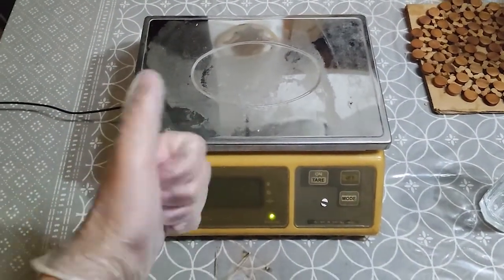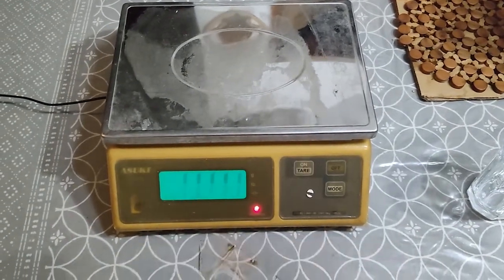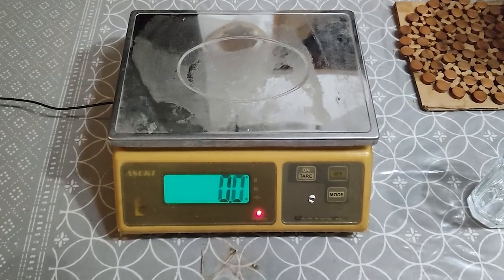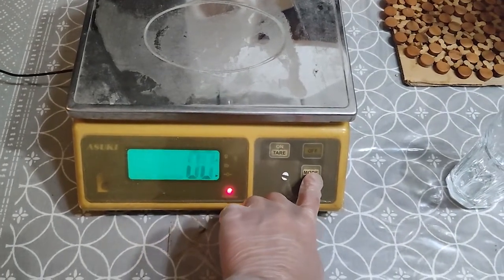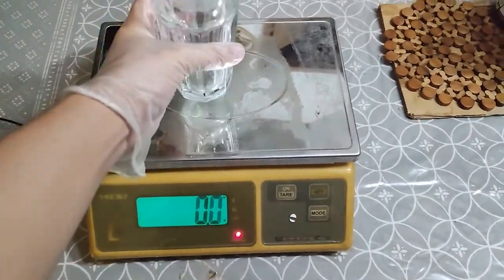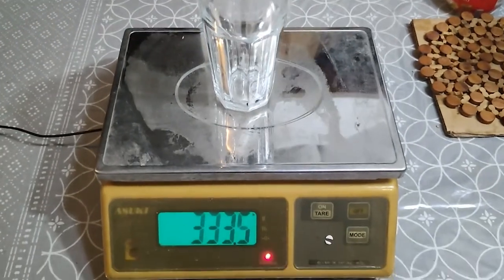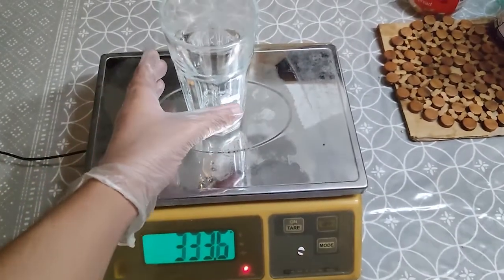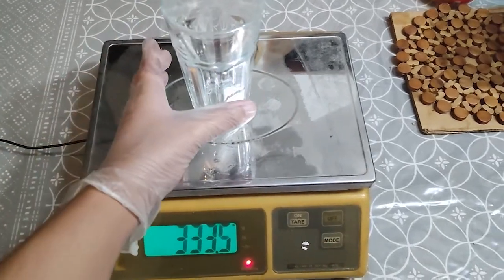So in this part, we will weigh the 50 ml flat bottom flask. However, because of our inability to go to the campus, we thought of using regular glasses instead of the flat bottom flask. We will weigh the glass up to the nearest 0.01 grams using the analytical balance. Note that the container must be clean and dry from the outside but need not to be dry inside. However, due to the unavailability of the analytical balance, we opted to use the industrial top balance, which can only record masses up to 0.1 grams.